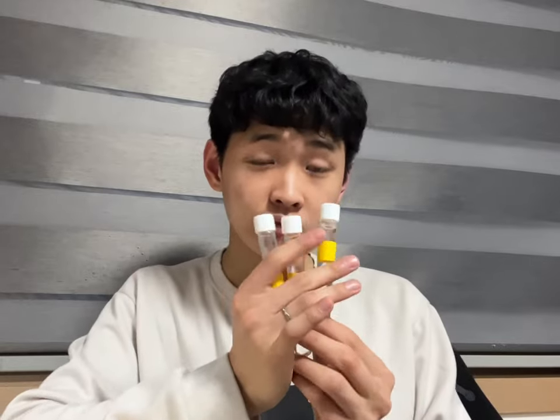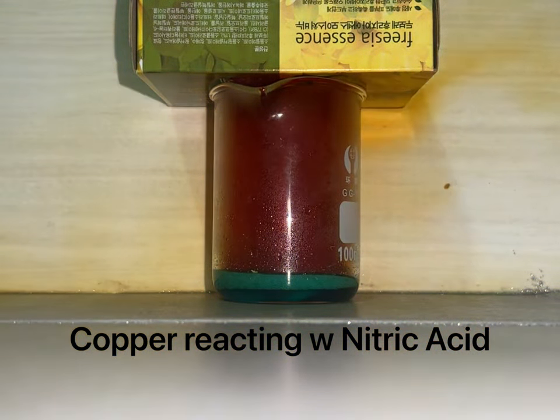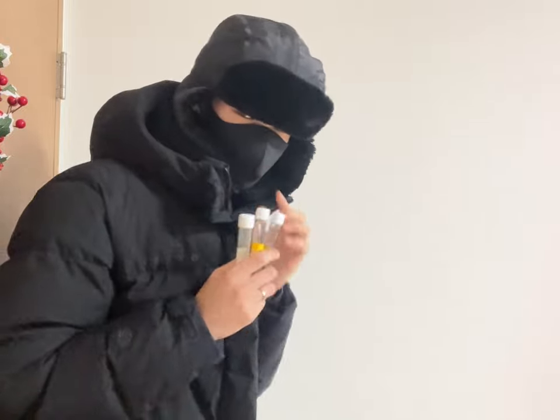Hey guys, I'm Dukurian and I'm going to show you how I make my nitric acid. You're probably here because you too want to make some nitric acid yourself. Maybe you want to do some experiments that require nitric acid, maybe you want to get yourself some nice tan to impress your girlfriend.